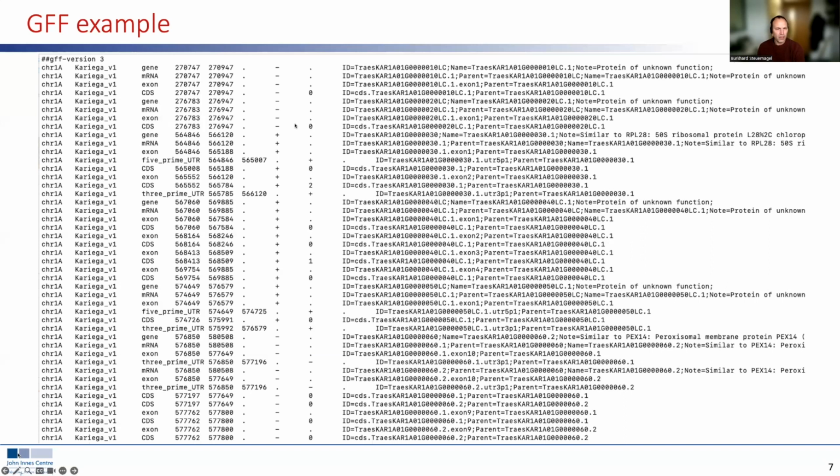Okay, so I hope this makes sense. This is quite a common format, and you'll always want to go into those text files and make sure everything is correct.